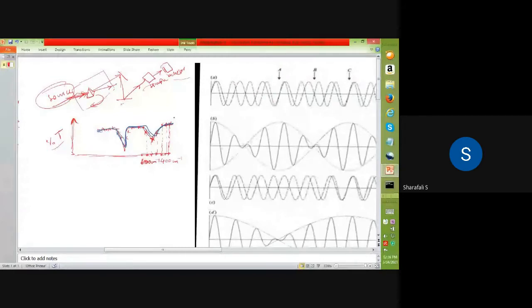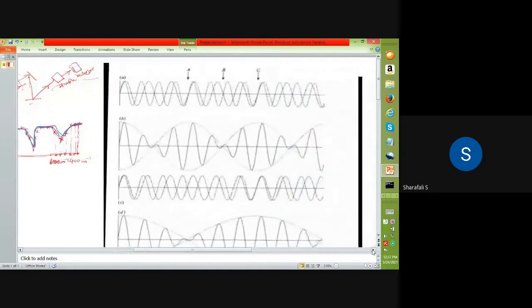The time required to get the sample spectra in a normal IR spectrometer is very large as compared to an FTIR spectrometer. So in order to solve this problem, we have another technique which was put forward by a mathematician. That is the Fourier transform, and that Fourier transform is implemented into this IR spectrum. So what is the principle behind this Fourier transform IR spectrum?